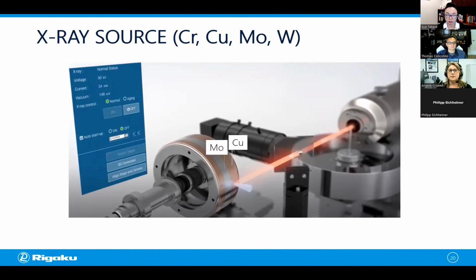We also use it because it produces characteristic radiation of a given X-ray energy. And so that's something that we'll want to use, and specifically some of the softer X-ray energies. So let's just look at that system. So in this particular X-ray system, we have a high-powered rotating anode. Here's the rotating anode, and it's spinning at very high speed.